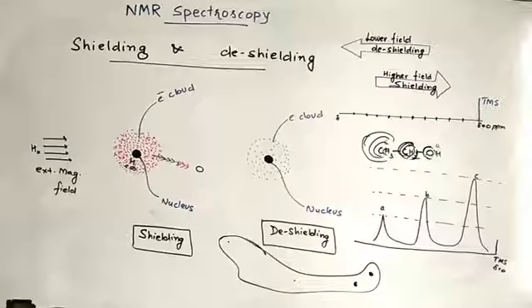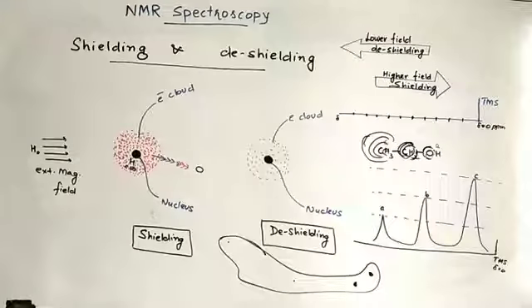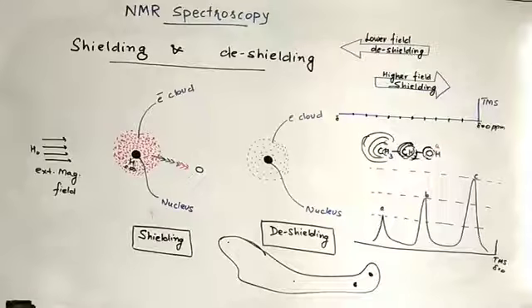If the molecule is in front of you, you can easily detect how many types of non-equivalent protons there are. The number of non-equivalent protons equals the number of peaks, because non-equivalent protons have a different environment, a different electron cloud environment. That's why they come into resonance with the radio wave at different field strengths.